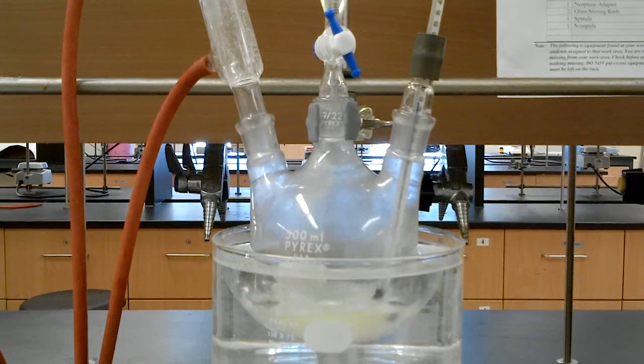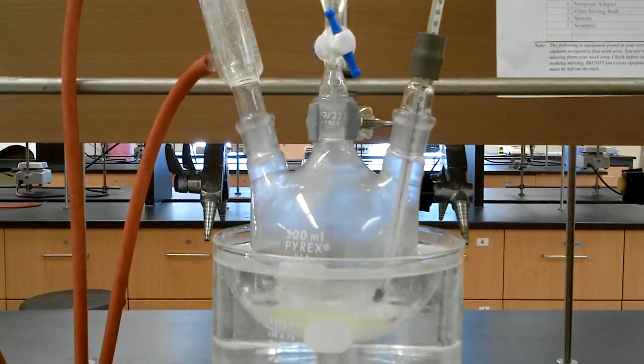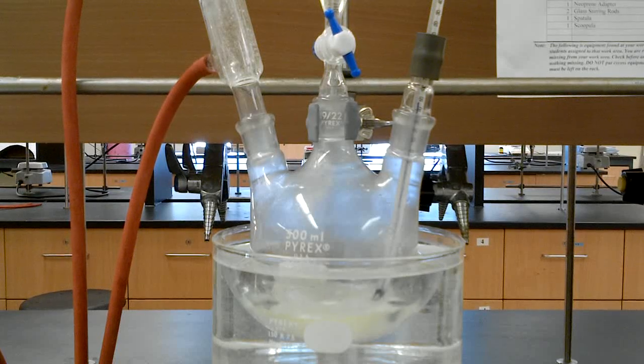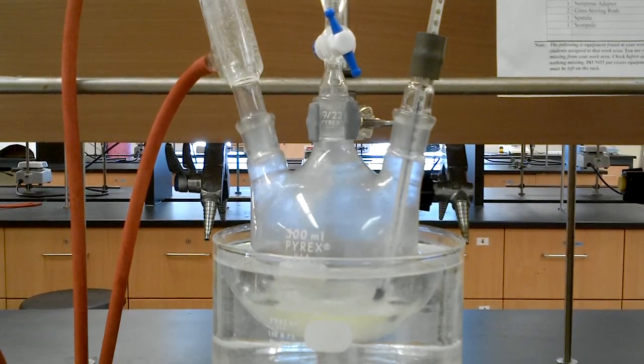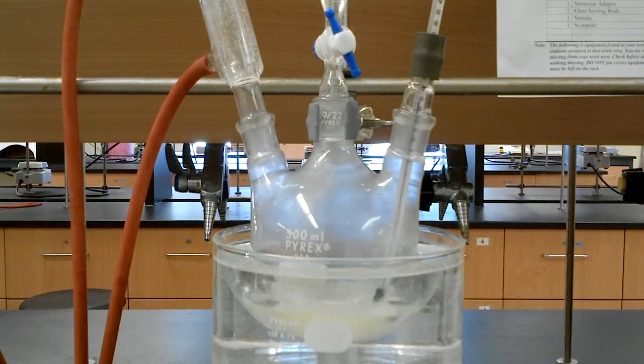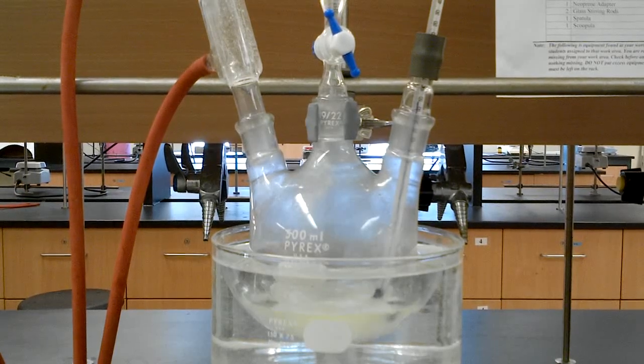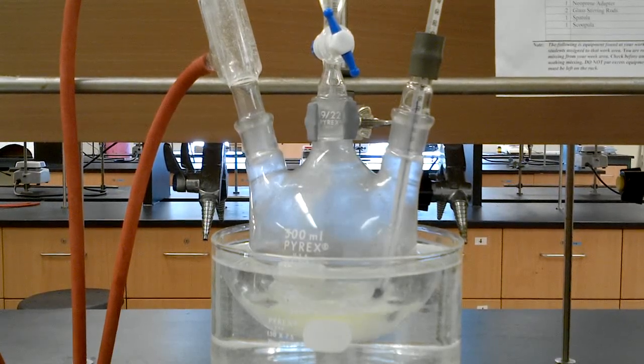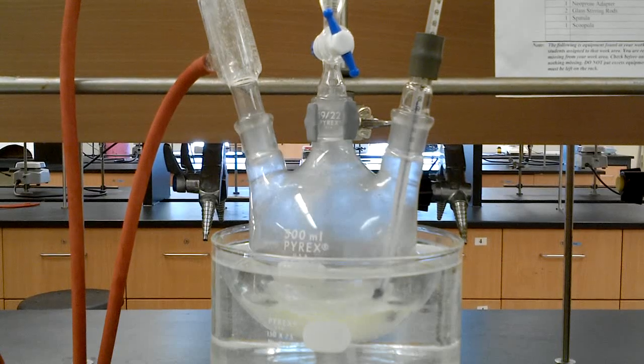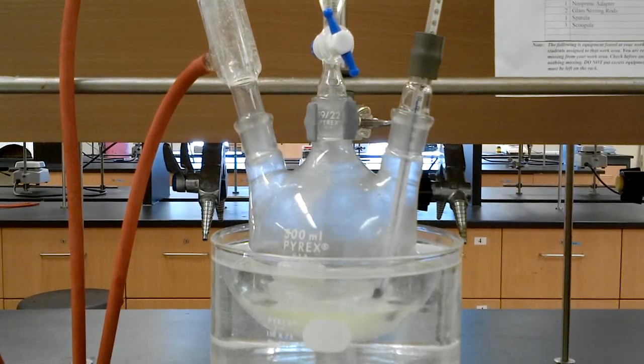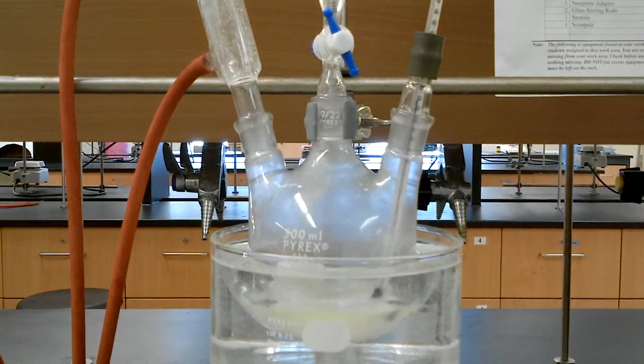So we're keeping the temperature at about 45 to 50 degrees. The warm water bath is helping maintain that. Stirring vigorously. Make sure we've got a good mix on this. And adding at a dropwise rate. Looking good. The color is quite nice. The yellow color is disappearing as fast as it's generated. Excellent.